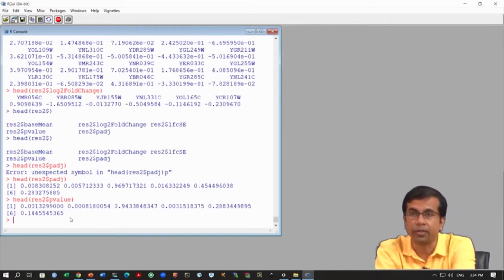So, what we will do is to generate this Volcano plot. We will first export this data into some variables, or assign some variables for this, maybe not x, or maybe x val, because x we have used before already.